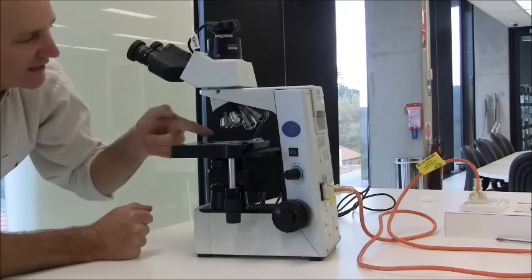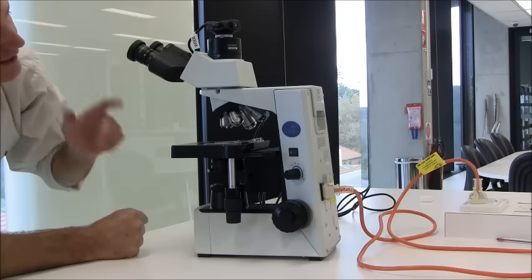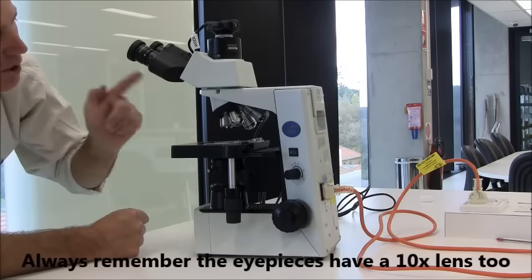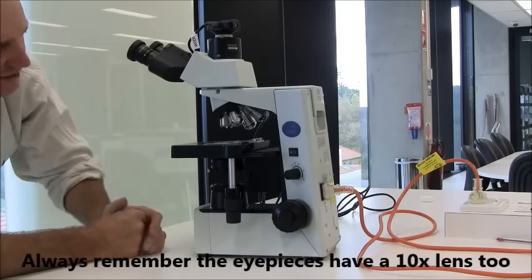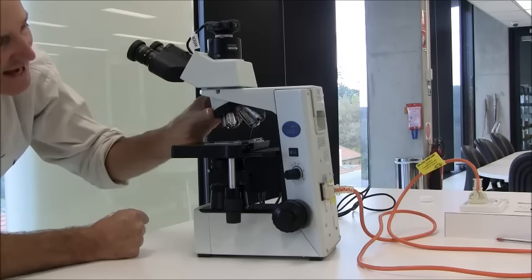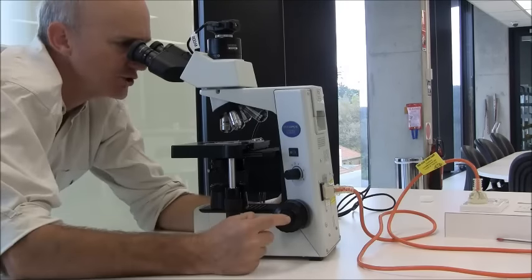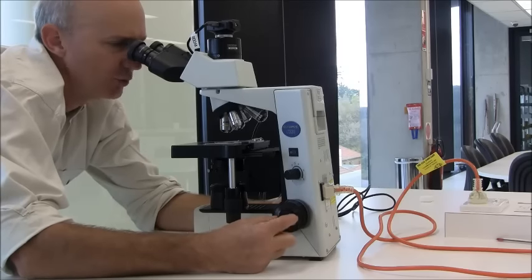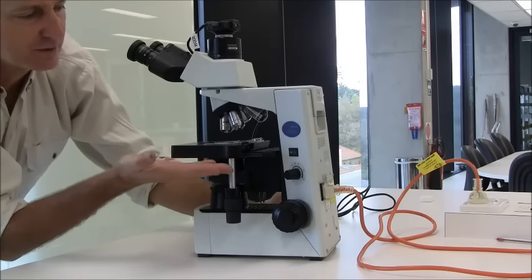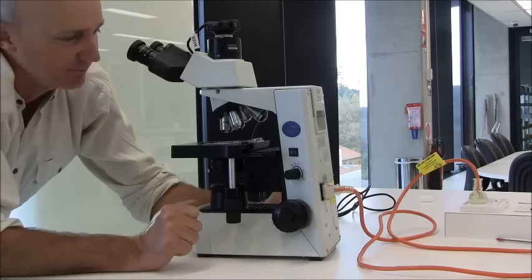Now, what I'm looking at under the microscope at the moment is times 40 its normal size, because the eyepiece lens is times 10, the objective lens is times 4, multiply them together, 10 times 4 is 40. So we're getting a lot of detail. If you want to look at that specimen in more detail, rotate it to the next objective lens, which will be 10 times 10, 100, and refocus, but only focus using the small knob on the inside. If you use the large knob, the movement out of the focal plane will be quite great, and you'll lose the image probably straight away, and sometimes it's hard to get back.